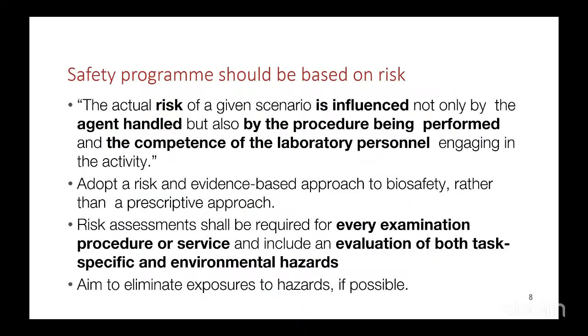Now, a safety program should be based on risk. Every safety program should be based on risk. The actual risk of a given scenario is influenced not only by the agent you handle, or by the procedures being performed, but also by the competency of the personnel engaging in those activities. So you need to adopt a risk and evidence-based approach when it comes to biosafety, rather than a prescriptive approach.